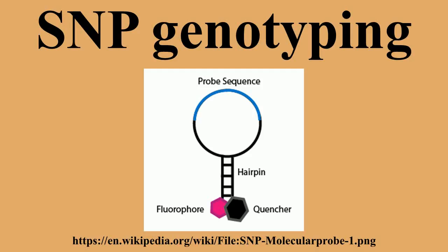APEX2 is an arrayed primer extension genotyping method which is able to identify hundreds of SNPs or mutations in parallel using efficient, homogeneous multiplex PCR and 4-color single-base extension on a microarray. The multiplex PCR requires 2 oligonucleotides per SNP, mutation-generating amplicons that contain the tested base pair. The same oligonucleotides are used in the following step as immobilized single-base extension primers on a microarray.